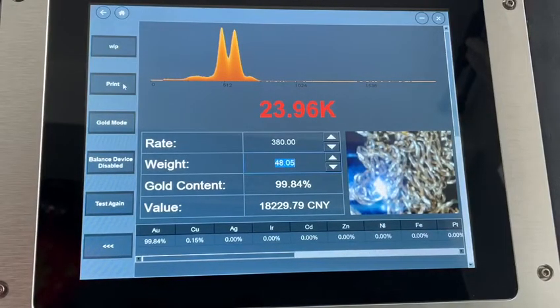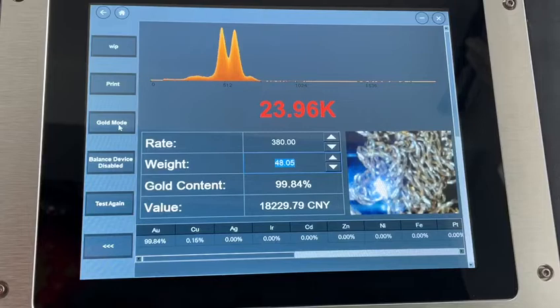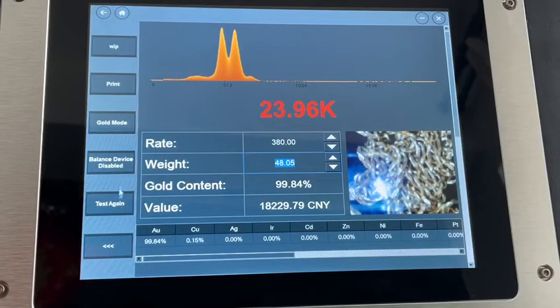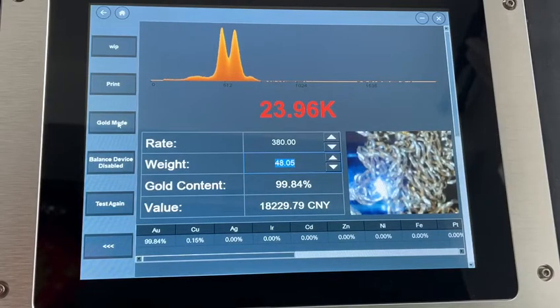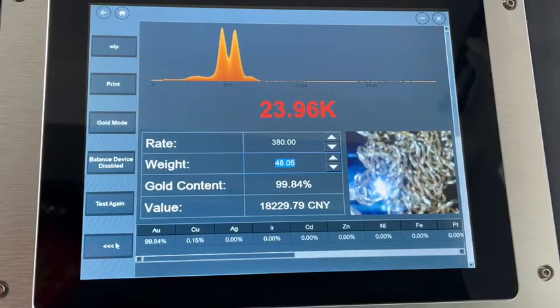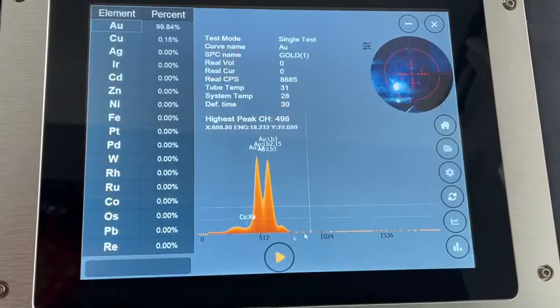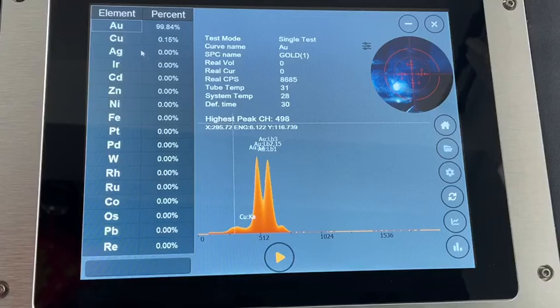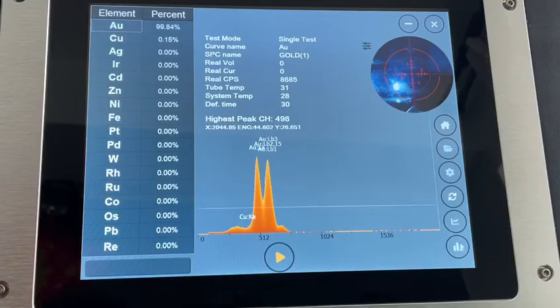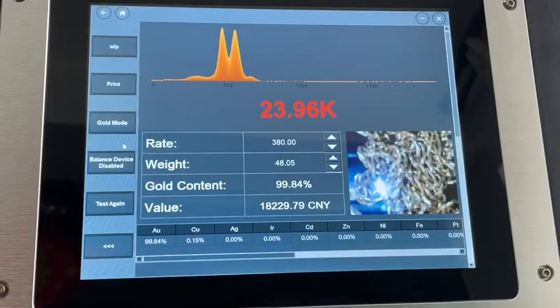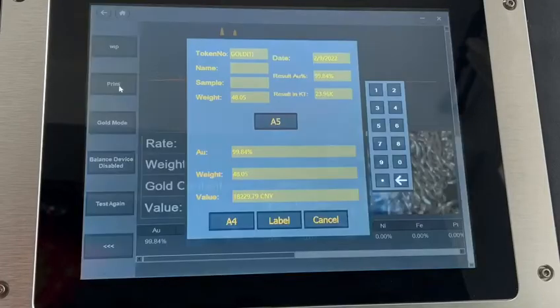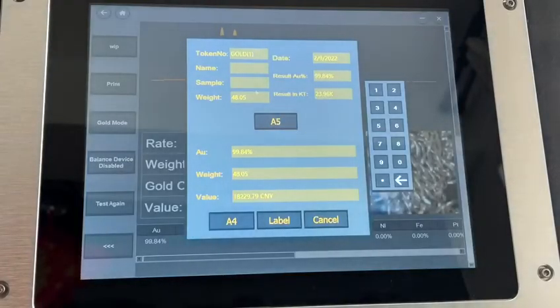You can do a printout, or you can test the value. This is a print. Go ahead and see results in the results page, and if you want to go back, go to data. You need to print out also.